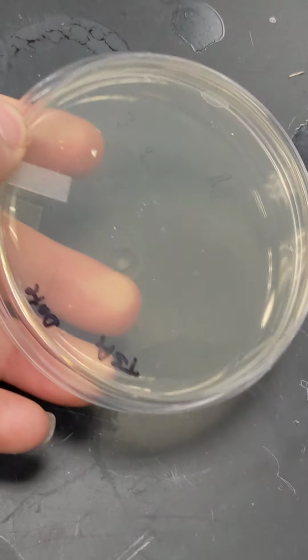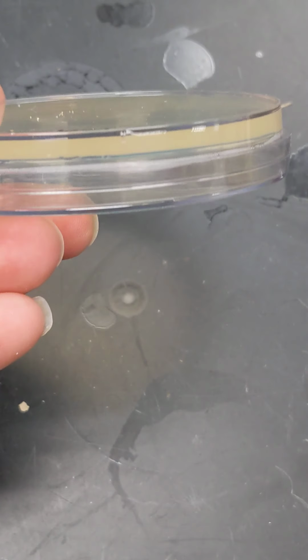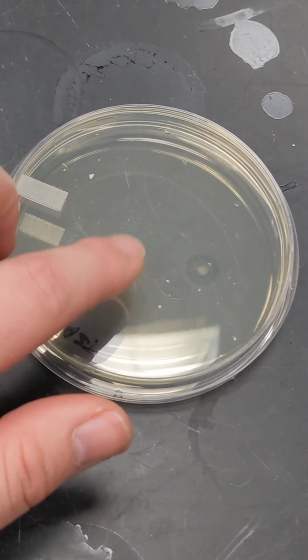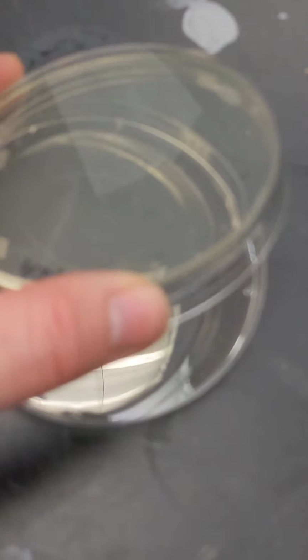After they're done, they're going to solidify. They're going to look like this. This is one I just made a few minutes ago. They're so fast. And when I store it, I'm going to store it upside down. Notice that it's 100% solidified. It's not going to fall out. In case these are still a little on the warm side, they're going to form a little condensation, and I don't want that to be all over the surface of my plate. So I'll store it like this.